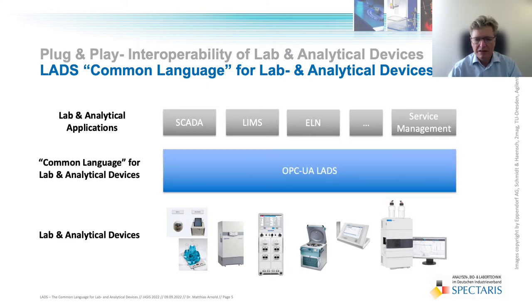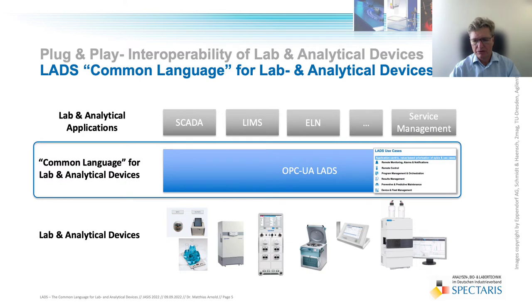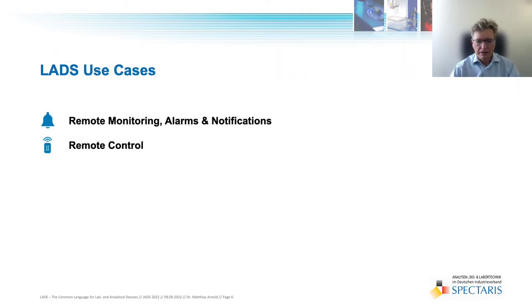The team behind the LADS OPC UA joint work group are trying to overcome at least some of the obstacles with an OPC UA based communication protocol that addresses some of the most important common use cases in the laboratory domain. What are the use cases we are targeting?